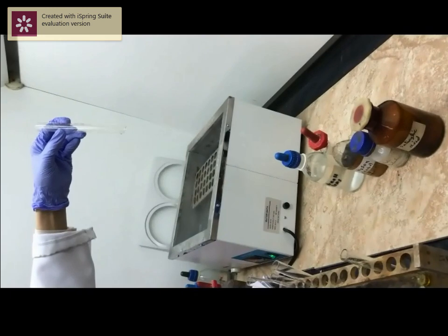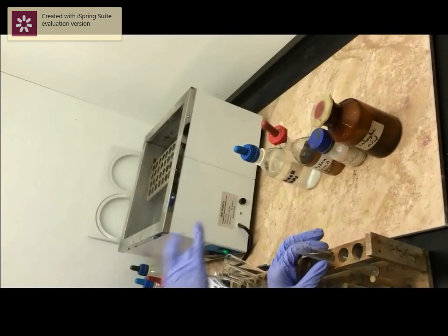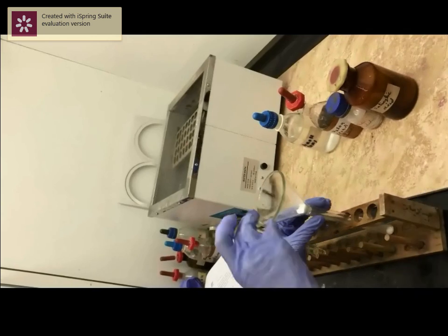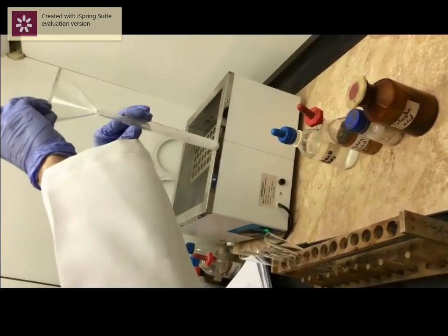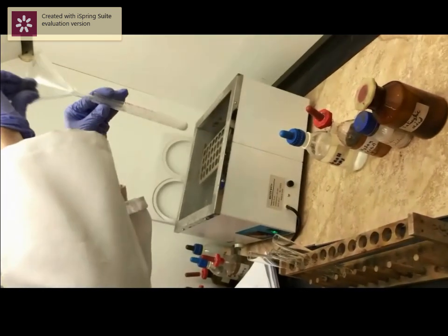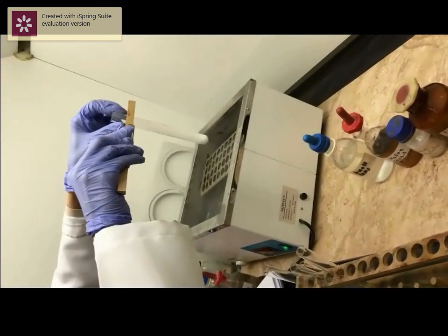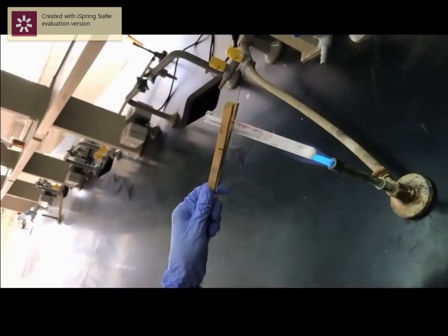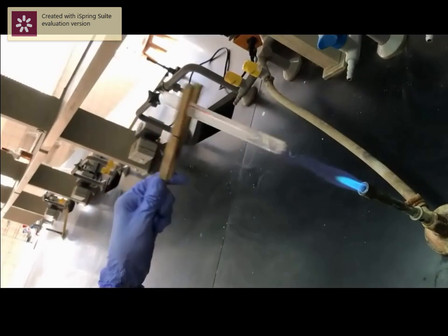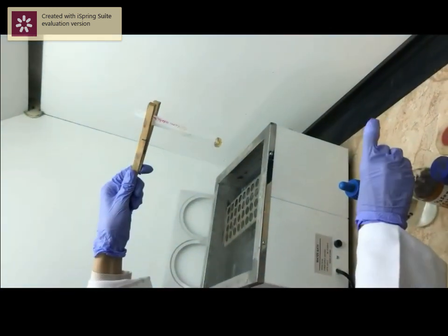In a completely dry test tube, we will fuse together a few crystals of salicylic acid and phthalic anhydride. Now we will fuse them together using a flame. We will add a few drops of concentrated sulfuric acid.